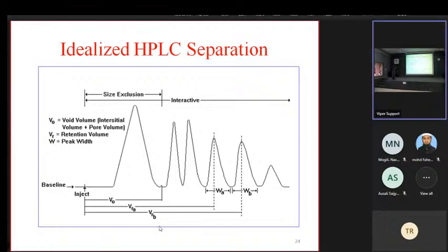Yes, proteins. We have many chiral detectors, especially for proteins. The major difference between small molecules and proteins is that biologics are larger in size, so adsorption and these kinds of columns will not work. Affinity chromatography is one option, and mass spectrometry is one of the detectors.